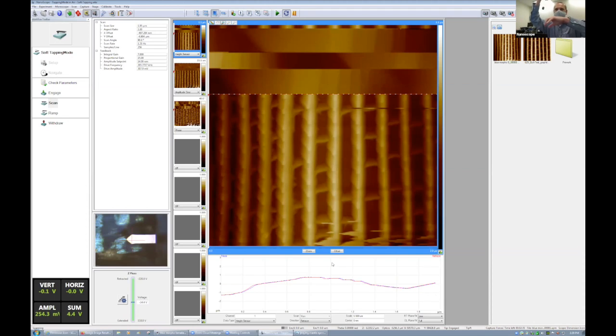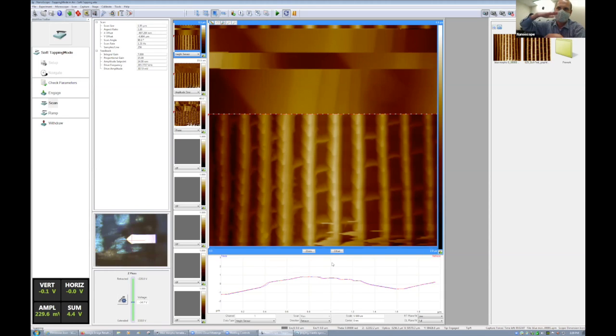As we bring the atoms closer between the tip and a sample, in reality, no 2 atoms can ever touch. As we get them closer and closer, there's more and more force between them, pushing them apart. And we can feel that with this cantilever. The cantilever bends. We have a very high precision of measuring the force on that cantilever.